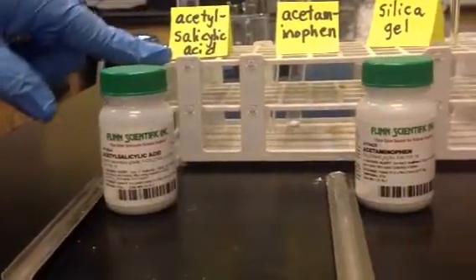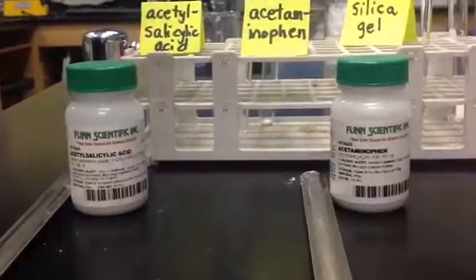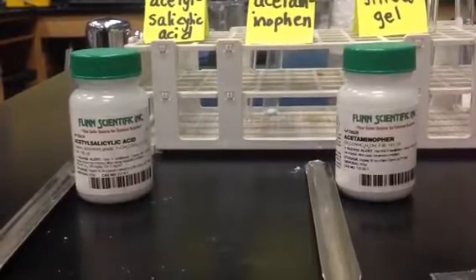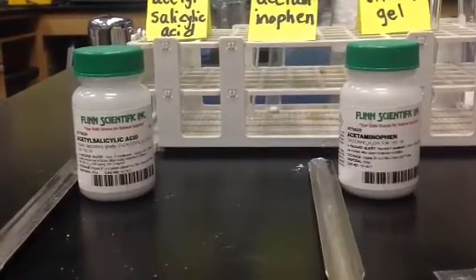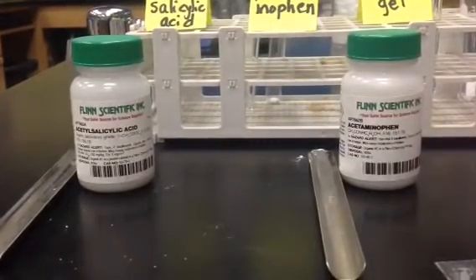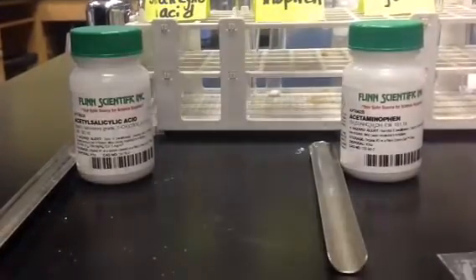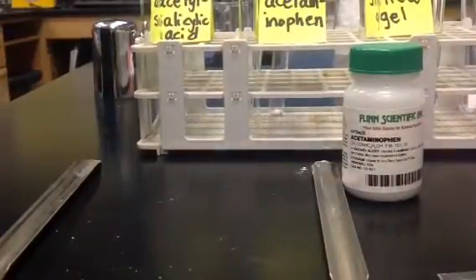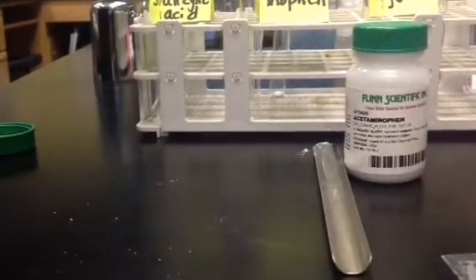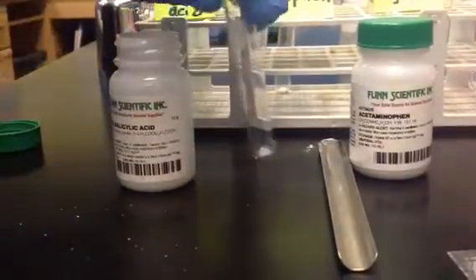So acetylsalicylic acid is a component of the mixture, acetaminophen, and a binding agent, which silica gel will act as. So getting 3 small test tubes, we're going to test the solubility of each of these. It says to get a pea-size amount, you want even less than that, okay? So this is plenty. And I'll put that in this test tube.